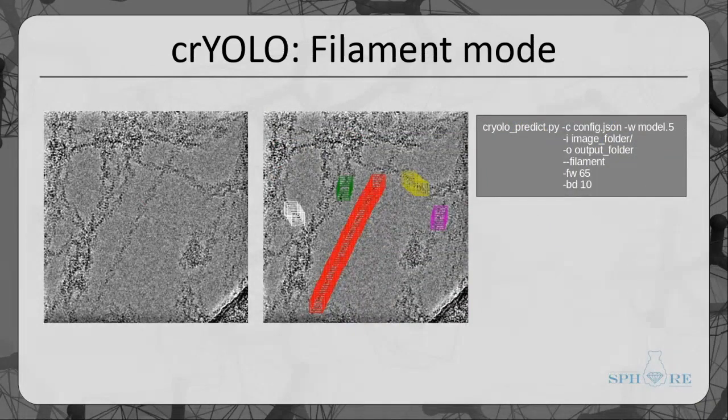More advanced examples where you have a lot of filaments that are aggregating, and it's pretty good in skipping these aggregates of filaments. So also for, let's say, more advanced data sets, the filament mode is working quite good.